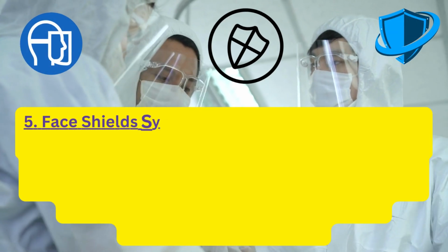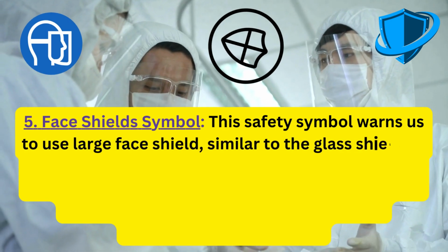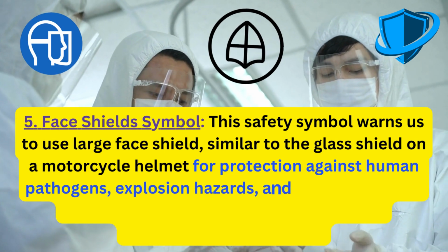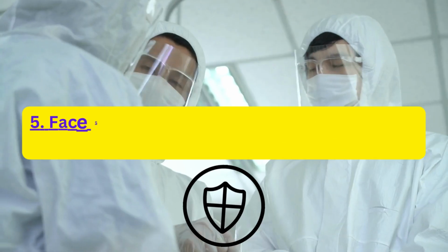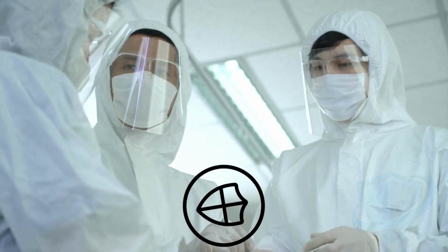5. Face shield symbol. This safety symbol warns us to use a large face shield, similar to the glass shield on a motorcycle helmet, for protection against human pathogens, explosion hazards, and heavy splashing of dangerous liquids such as acids, bases, and many organic liquids. It also provides us with extra protection against extreme temperatures.